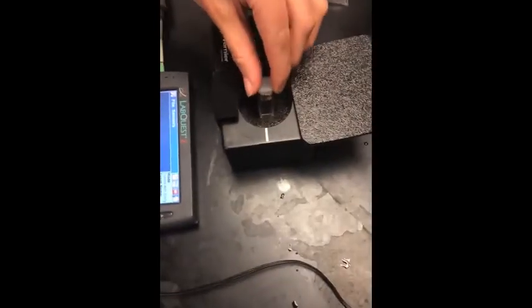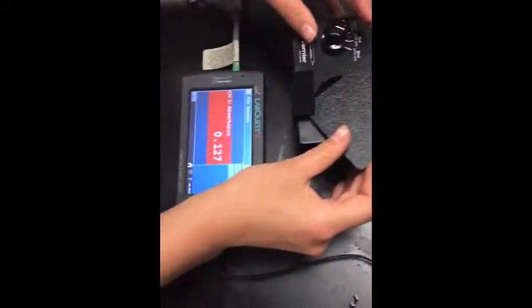Open the colorimeter and make sure when you put the cuvette in, it faces the line. Close the colorimeter.